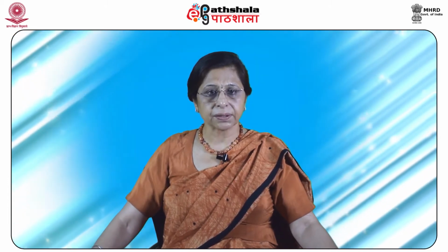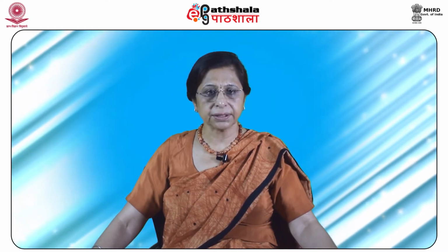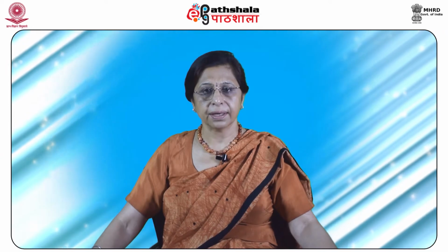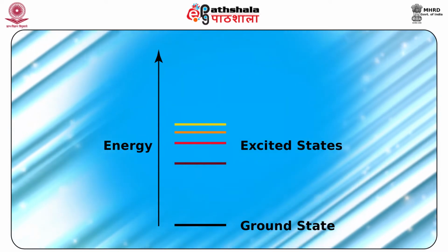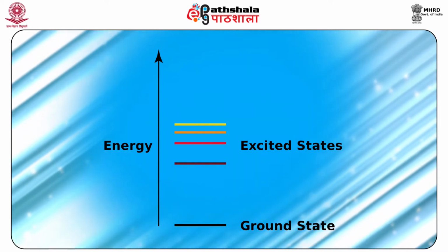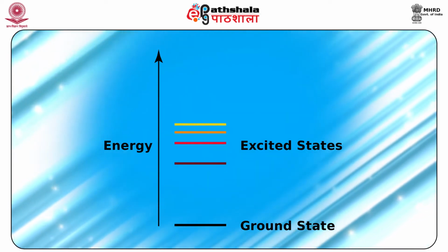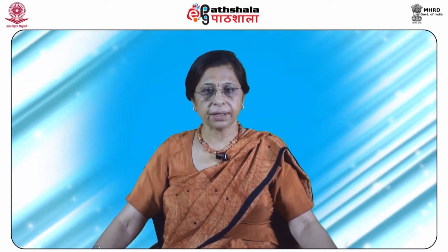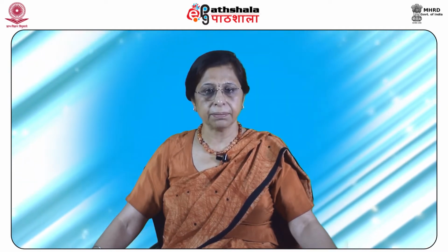The band-like structure of UV visible spectra arises as transition takes place over a wide range of wavelengths rather than a single wavelength. This can be explained on the basis that each electronic energy level in a molecule consists of closely separated vibrational and rotational energy levels, so that molecule can undergo electronic and vibrational rotational excitations at the same time.